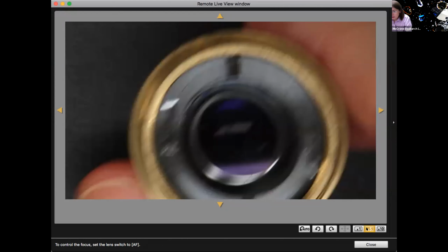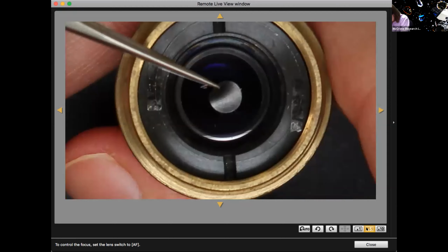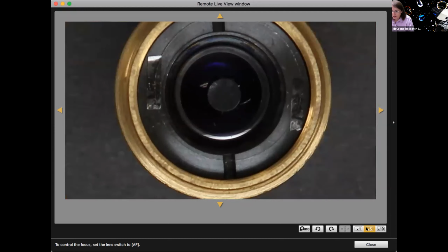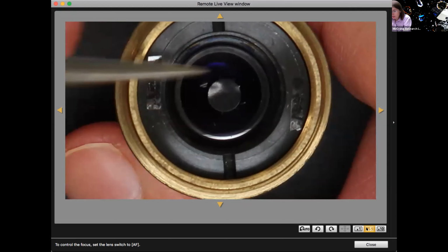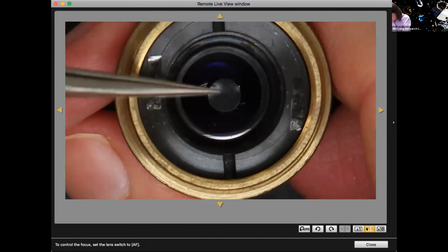And then, to the best of your ability, you want to center that onto the cover slip. And the nice thing about using electrical tape is if you find that that stop is not centered, it's very easy to just peel that off and reposition it without having to pull up the whole cover slip. So that's why I would say this is my preferred method.